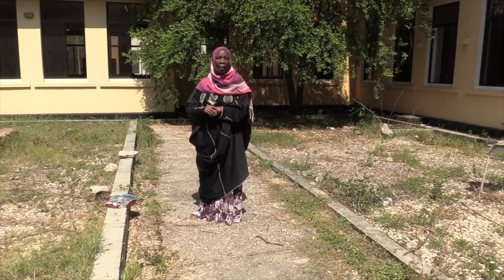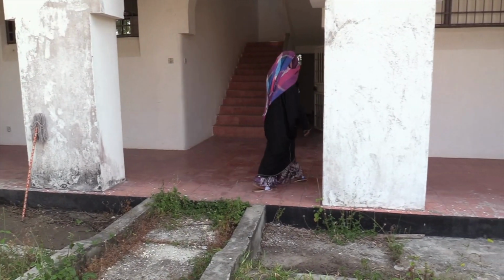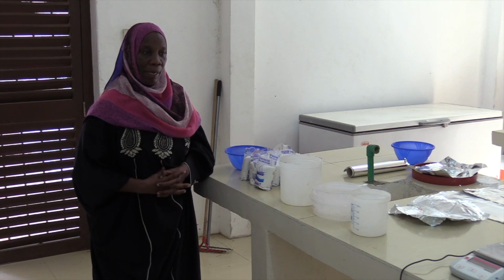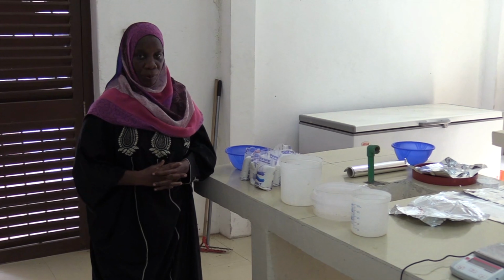In the second process here, we are going to analyze our sample of sand to find the amount of microplastic present there. Here we want to make the separation of our microplastic from the sample.